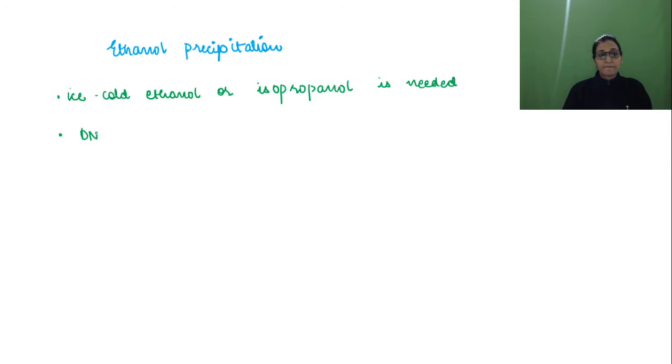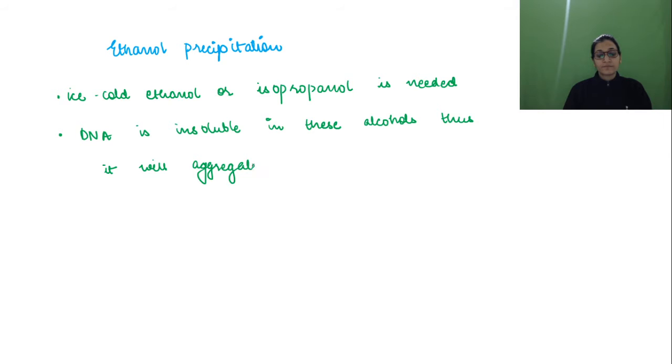So DNA is insoluble in these alcohols. Thus, it will aggregate and form pellet upon centrifugation.